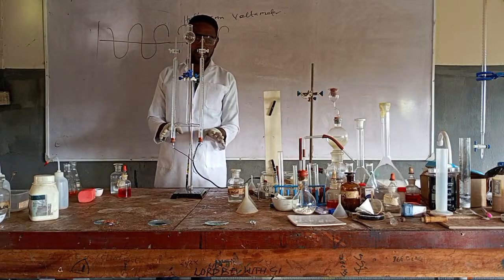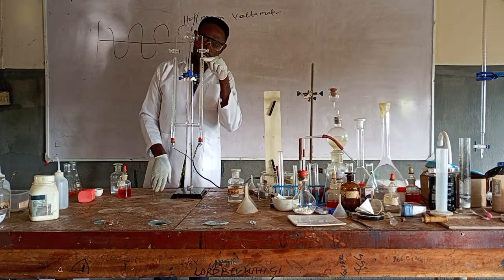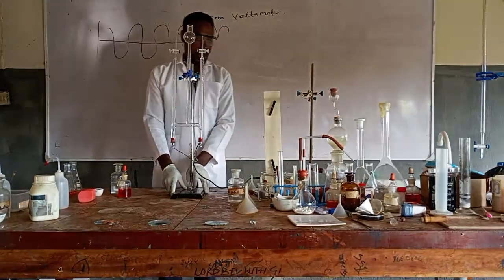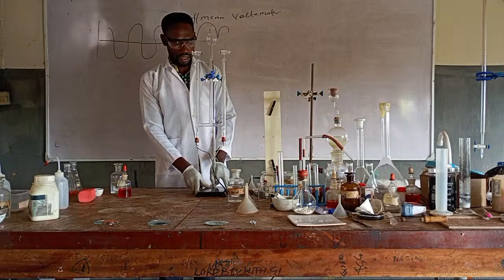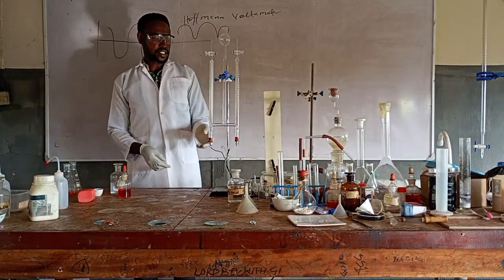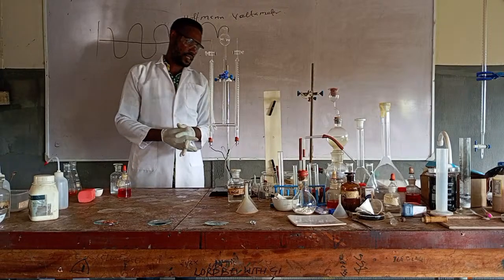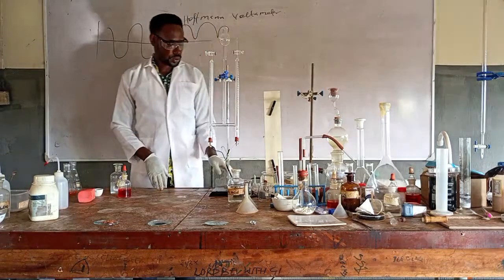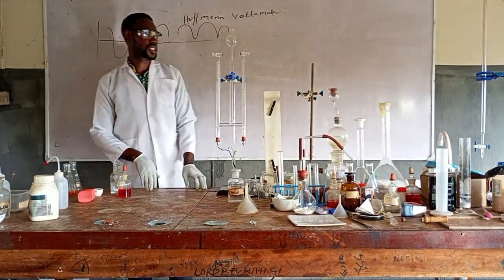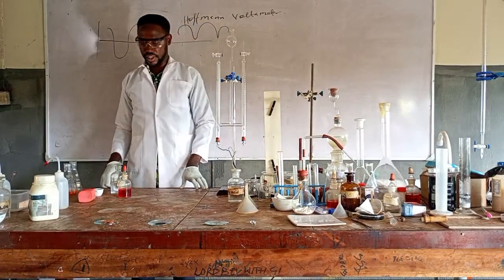What I'm carrying out now is what? Electrolysis of water. As you can see already, the volume of this is going down. But don't worry, it will be obvious. We cannot keep waiting for it. So it's already in progress. I think we find another thing and continue and observe it. If I had acidified it more, the process would be more pronounced. Am I communicating? Because water is a poor electrolyte, give it a little time. Okay? So with this, we have decomposed water into hydrogen and oxygen. Don't worry about time, it's going to be very, very obvious.